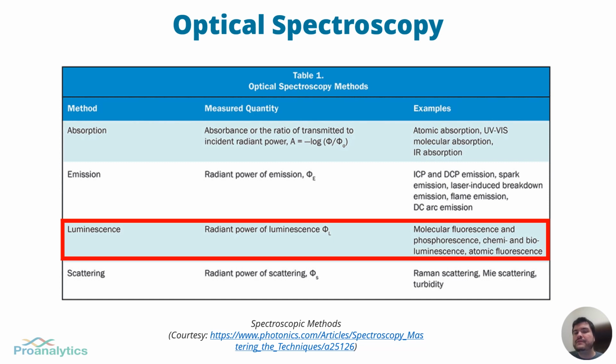Different fluorophores have different emission spectra, and this method can collect information on fluorescent compounds in the sample. UV spectroscopy and fluorescence spectroscopy are complementary methods, as fluorescence spectroscopy measures transitions from higher electronic energy states to the ground electronic energy state, whereas UV spectroscopy measures transitions from lower electronic energy states to higher electronic energy states.